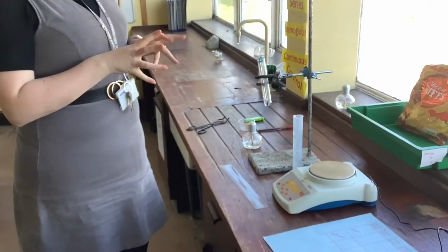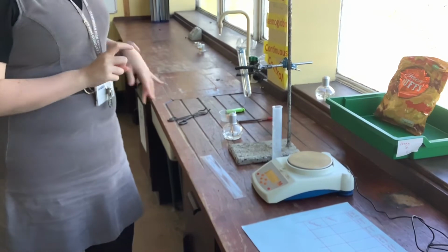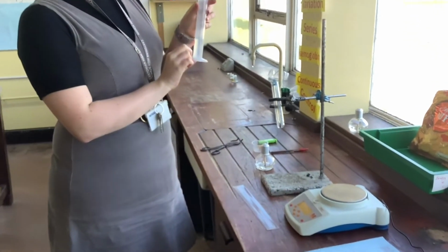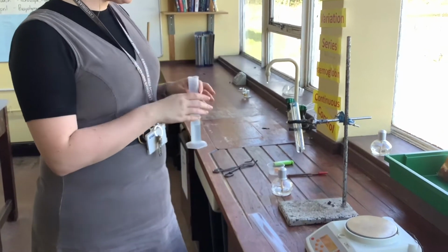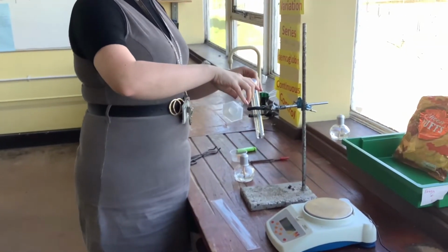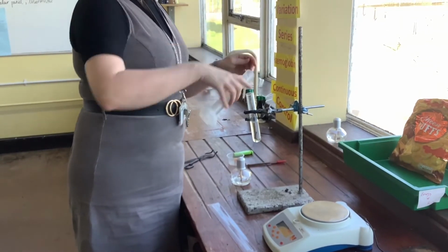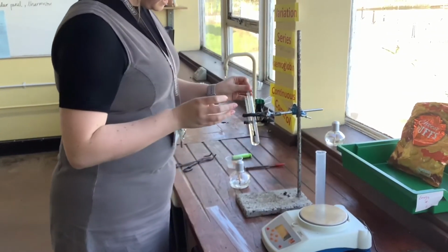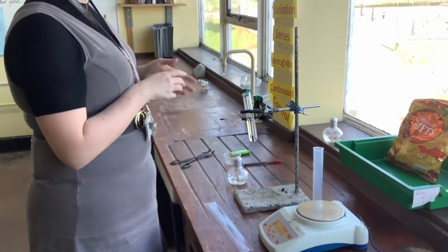This is the energy released in fuel practical, for the additional science chemistry. So the first thing we're going to do is measure out roughly 20 centimetres cubed of water and put it in our boiling tube. We are then going to record the initial temperature of our water, leaving the thermometer in the water. Don't just fling it around, as it will go to the air.